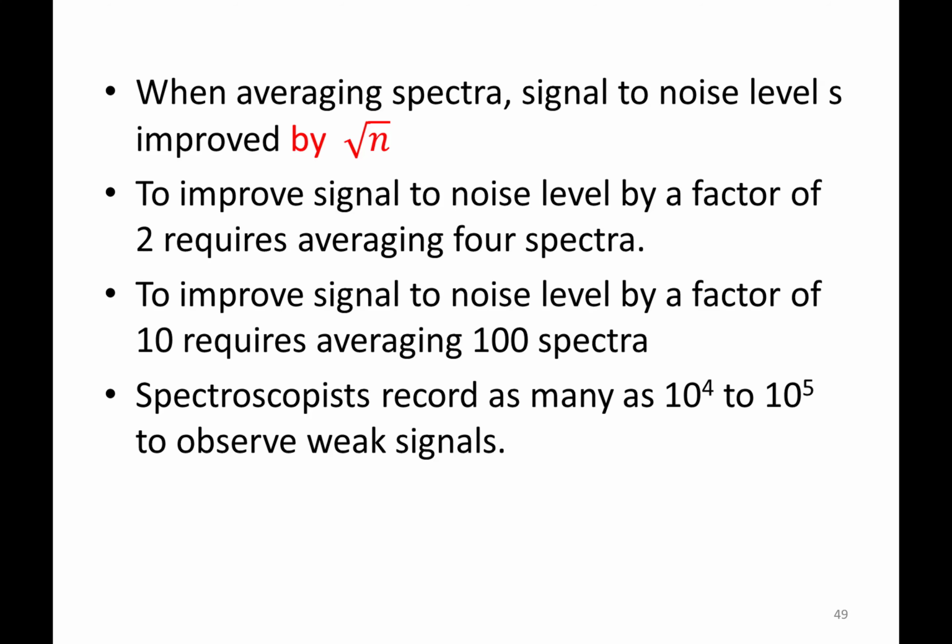If it is 5 spectra that you have and you want to improve the signal to noise ratio, you square that number, you will have to get 25 spectra. A consequence of that, therefore, is you stay on the instrument for a long time, okay? And that's how to improve the signal to noise ratio. If you want to see that the signal is above the background, you want to increase the intensity so that you are sure of that particular signal, okay? That it's a real signal.